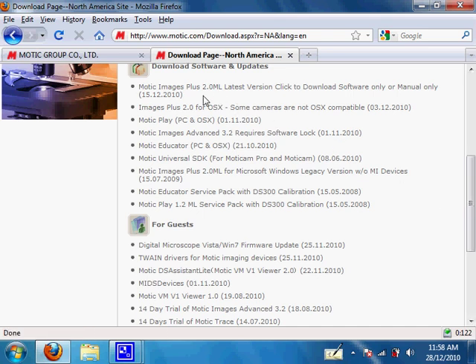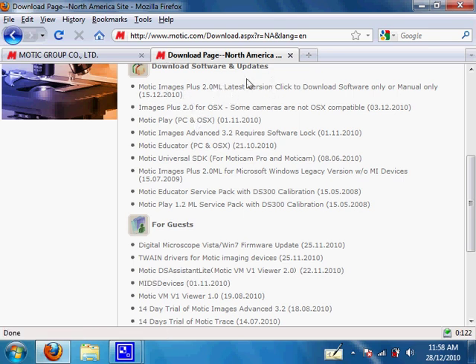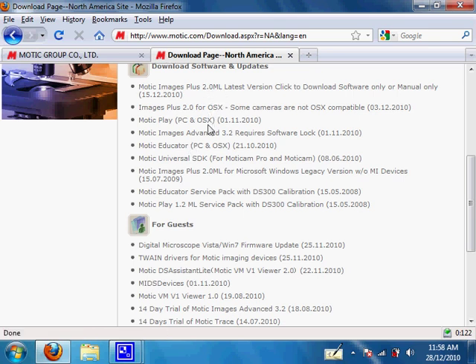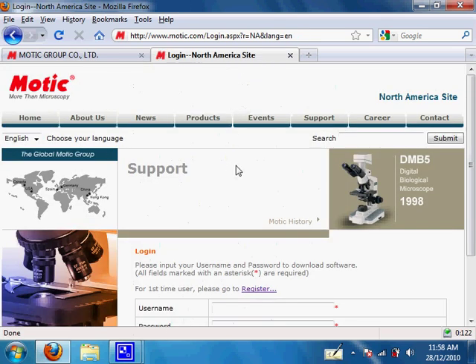For mine, it's Motic Cam 2300, so I will need Motic Images Plus 2.0 ML latest version. Most models will use this software; some lower-end models such as those used in high school or elementary schools will use Motic Educator or Motic Play. So let's click on Motic Images Plus 2.0.